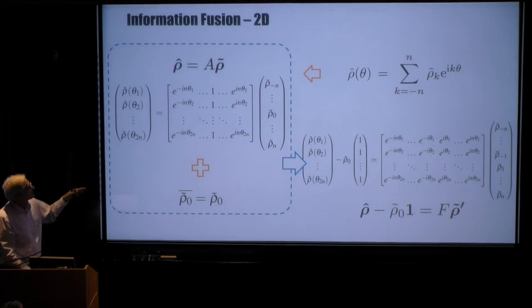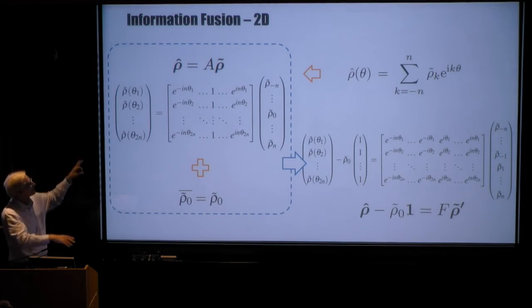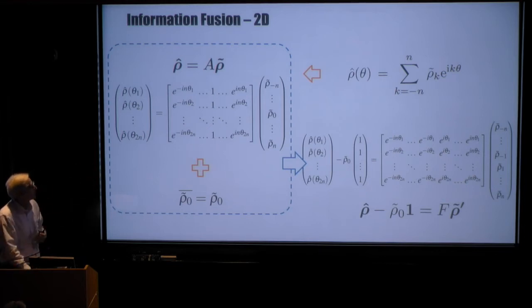And so basically we can expand a Fourier series around each circle of each radius in Fourier space. Here we're just going to say radius 1 to make life easy, but it's the same procedure for all radii.